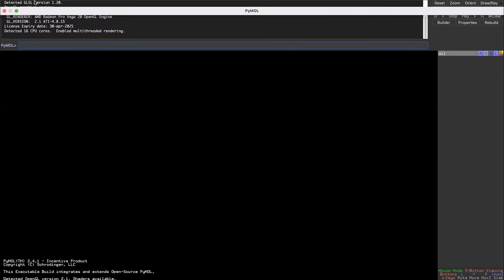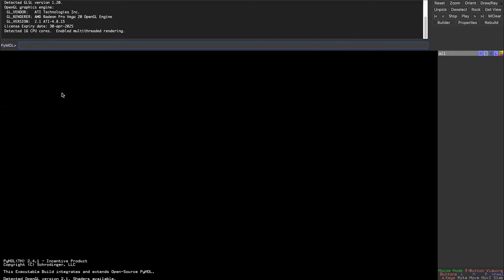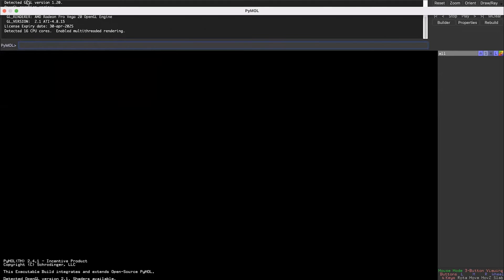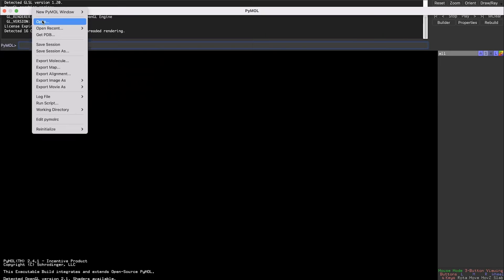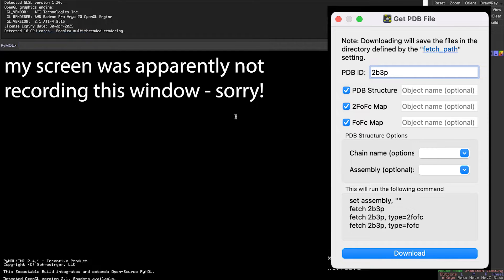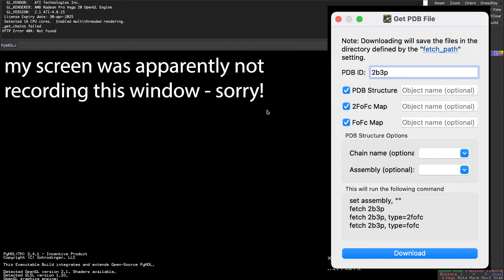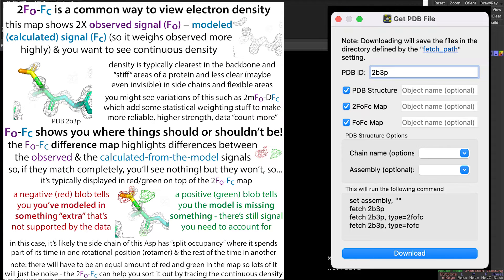In these cases we're fetching them since we don't already have the files on our computer. If we had them, we would use 'load' in the command line or 'File > Open' in the GUI. Since we don't have them yet, we'll go to File > Get PDB. We have 2B3P — that's the code we just found. By default it's going to give us the PDB structure, which is just the model, but we want to see the model and the map. You can see there are actually two different maps you can download: the 2Fo-Fc map, which is the main map you typically see, and the Fo-Fc map, which is a difference map.